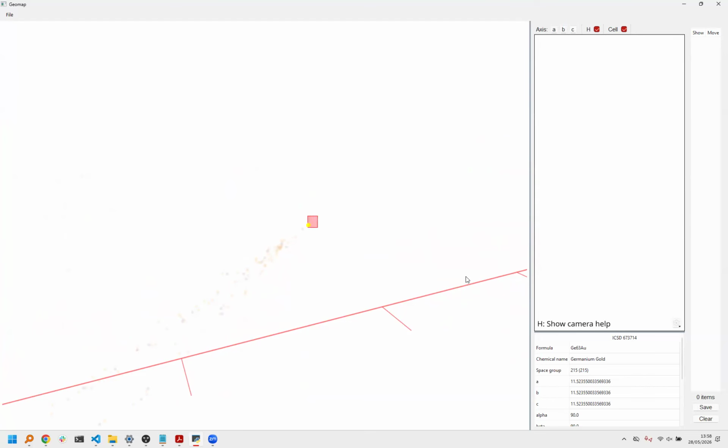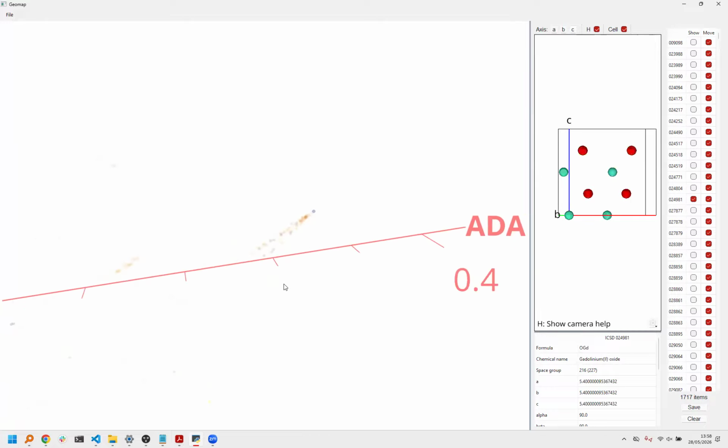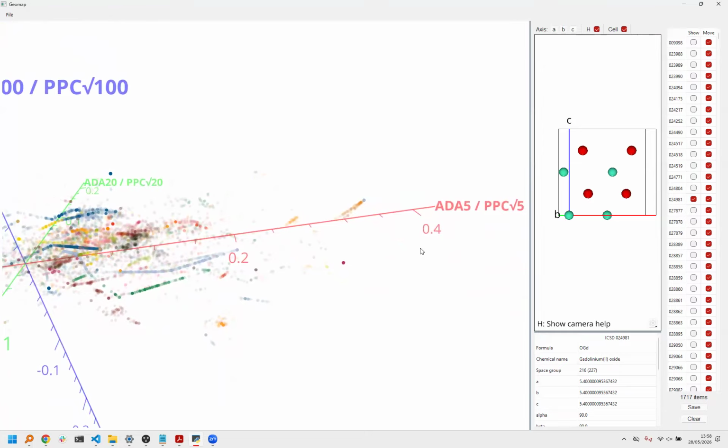And we can check how many there are that look like that. 1,717, and you could just scroll through if I wanted to, down, down, down. Of course, they all look the same. And those structures that were similar are now doing this, where they're just smudging, so the smudge coming out of the single point, right?